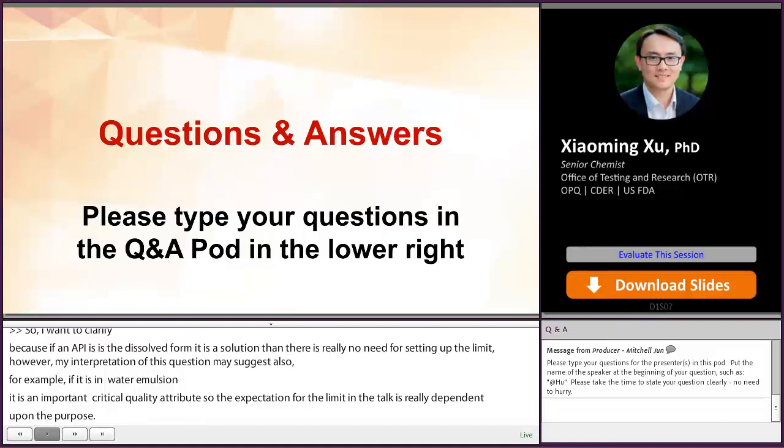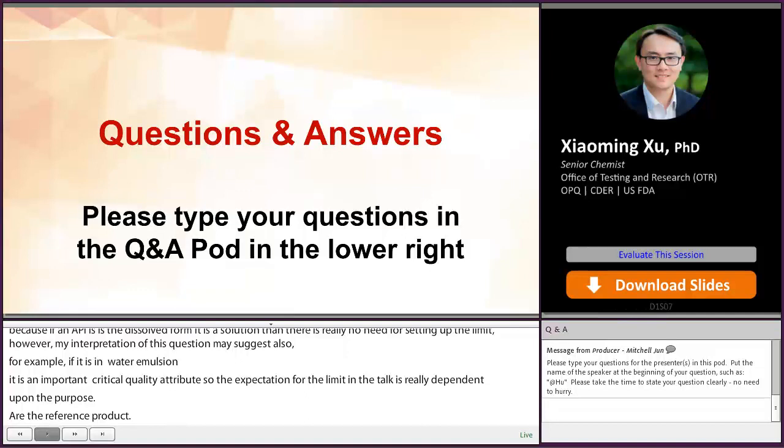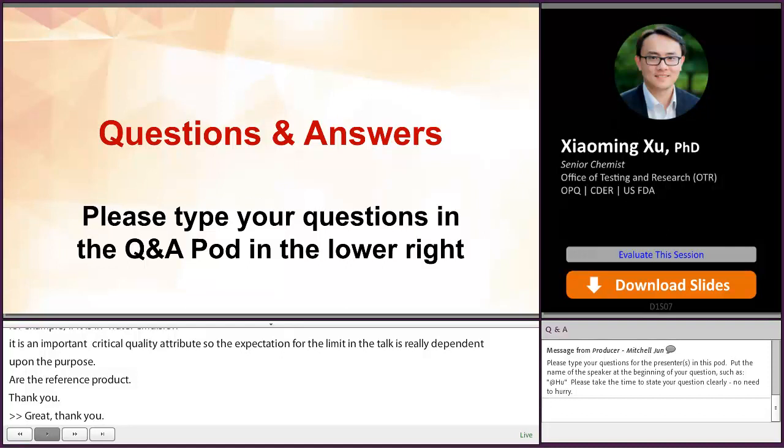Great, thank you. And we have one last question for you. For injectable suspensions, what is the proper PSD method? For generic injectable suspension, what is the minimum number of RLD batches required for the PSD comparison?